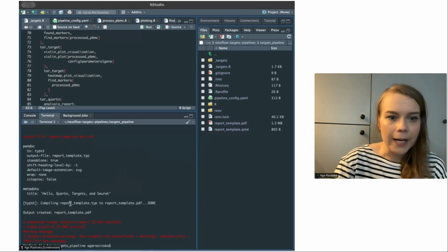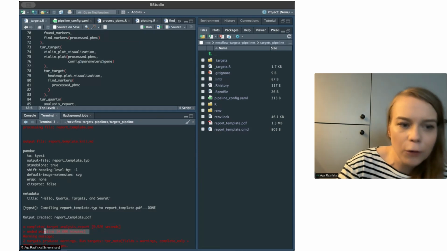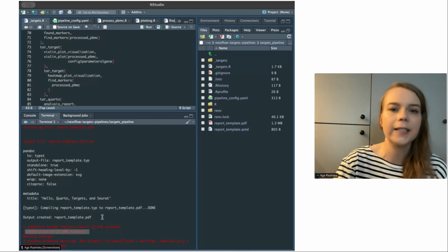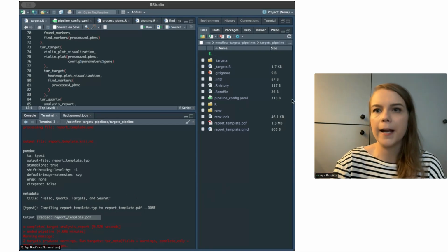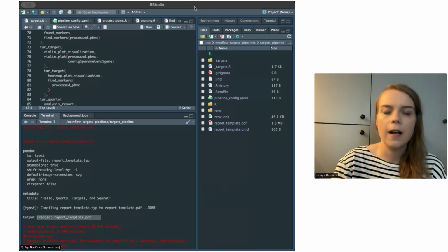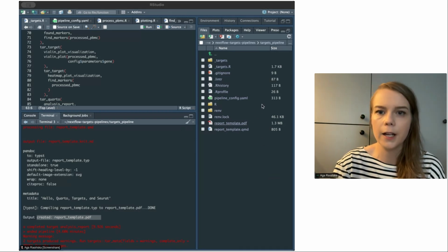All right, okay, we have our pipeline finished. You can see like 4 minutes, so a little bit longer than the Nextflow. Everything is in the PDF. It includes some visualizations. Let me just open the PDF, and probably I need to stop sharing this particular screen in order to show you the window and share.